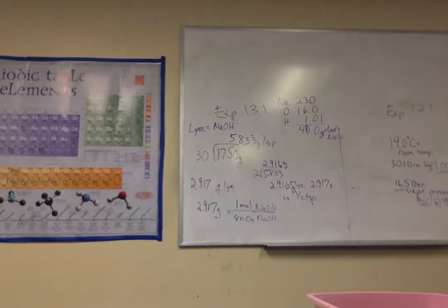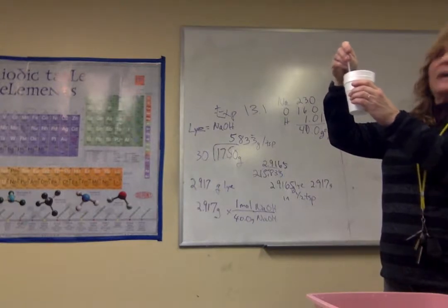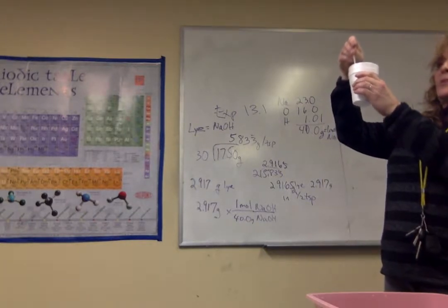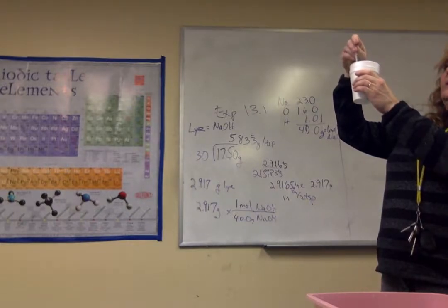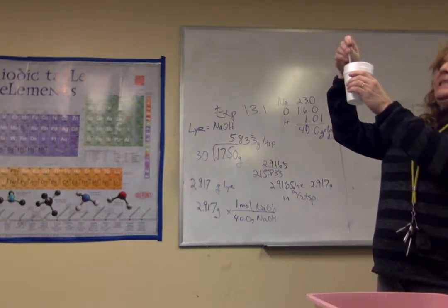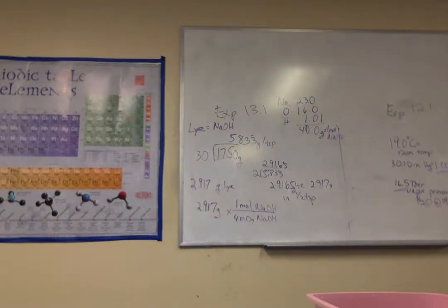Hold on one second. Actually, guys, you know what? The reason why is it wasn't constant for 2 consecutive times. It went up really high, then it went down. So we have to use this one. 26.9. That's the one that stayed. For the final? Final, yeah, T final.